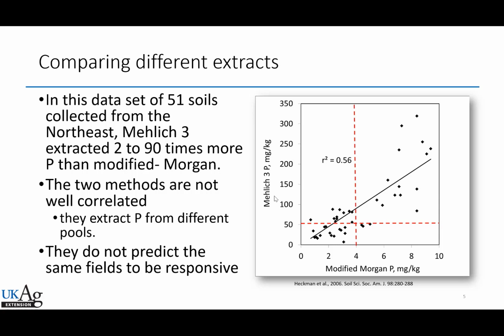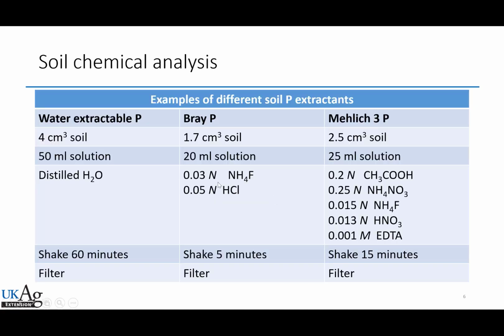So we definitely can't go across state lines and use different soil test extractants. And that's because there's basically different chemistry in those extractants.